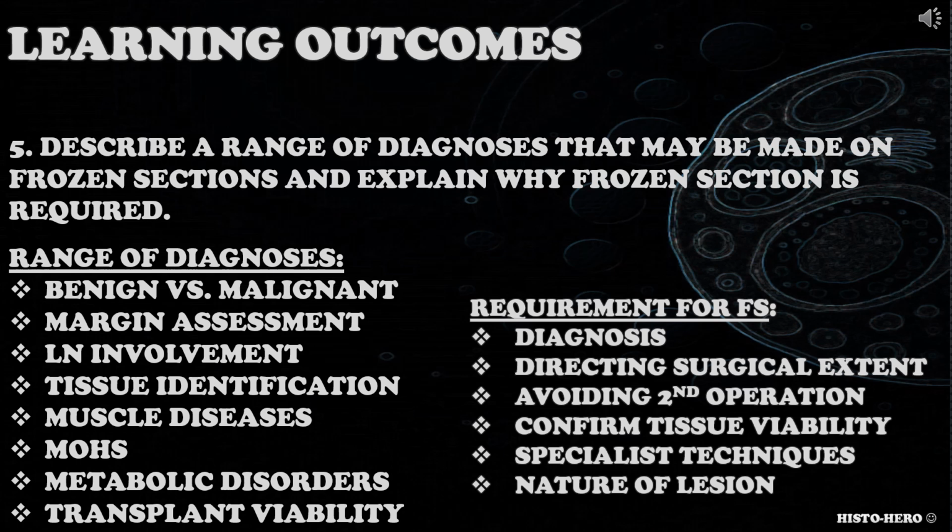Why is frozen section required? Consider diagnosis, nature of lesion, surgical management and guiding extent of surgery, tissue viability confirmation, enable special techniques like molecular testing and so on.